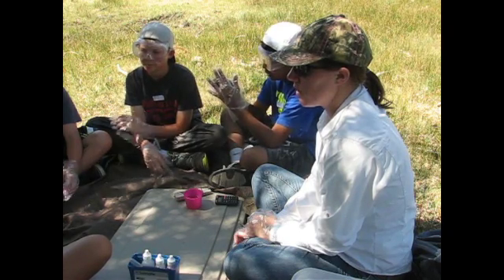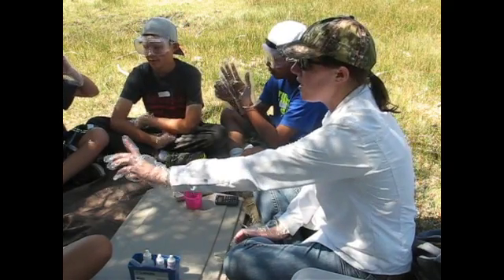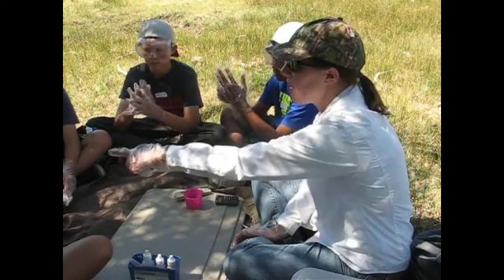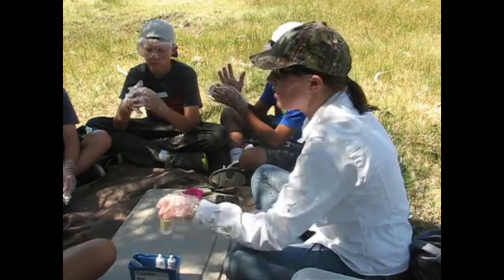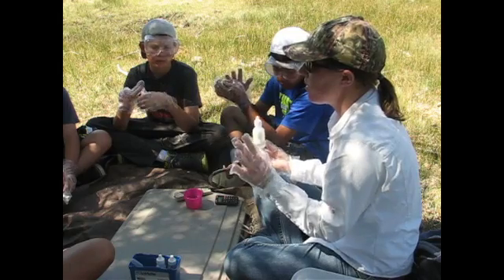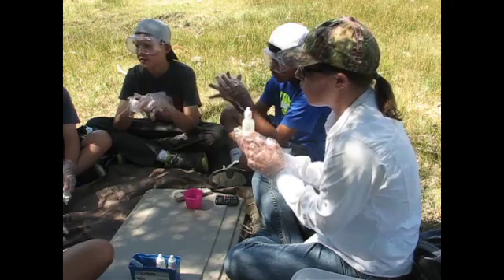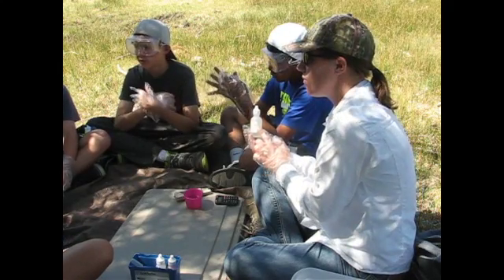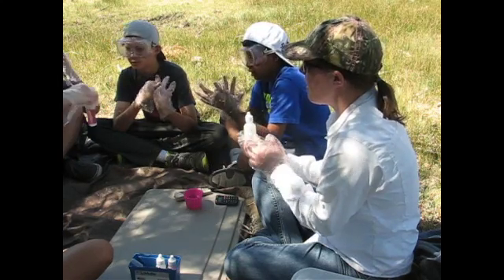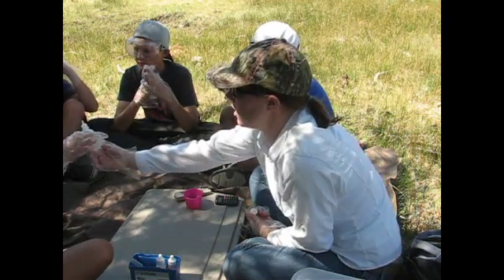Let's see. Okay, so if you can see, it's completely mixed in, and it's a nice pink color. Now what we're going to do is see how many drops of this it takes to turn the water from a nice pink color to a blue. It's already bluish. If you see it from here, it looks blue. Well, then maybe it won't take that many drops, but we're going to see how many drops it takes. So here you go.